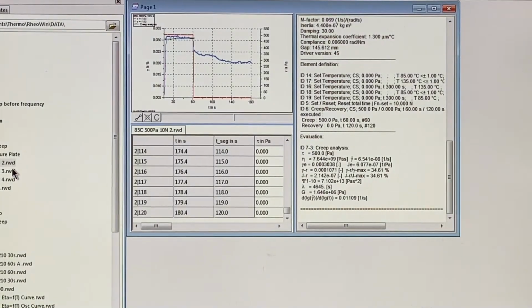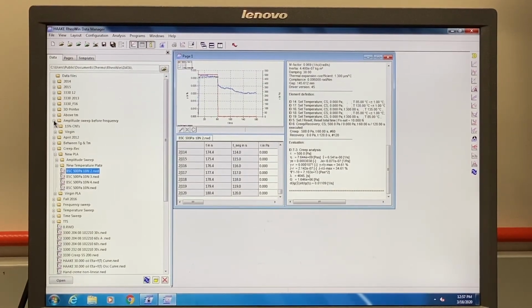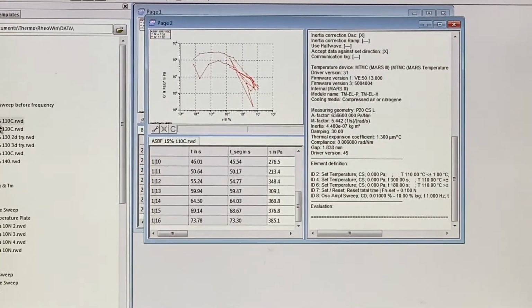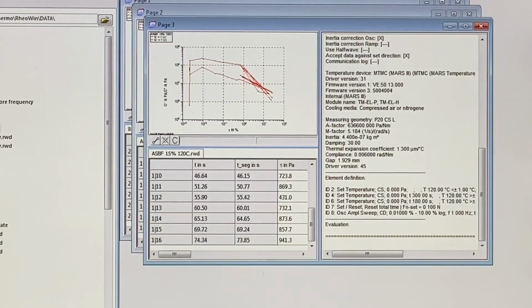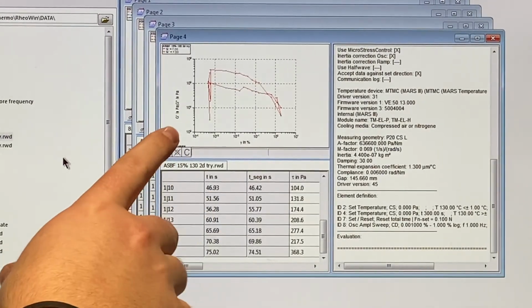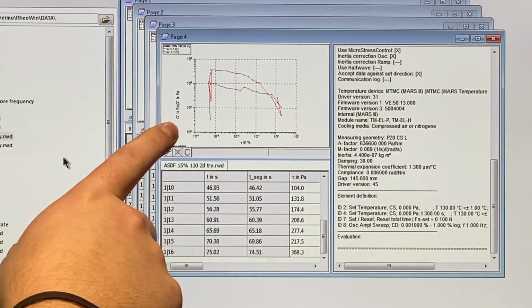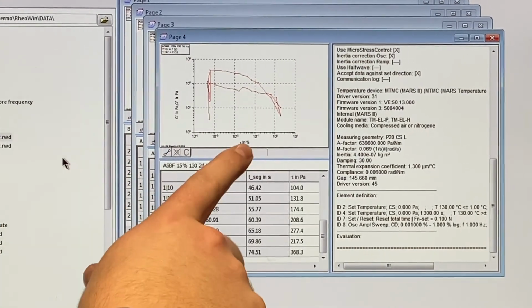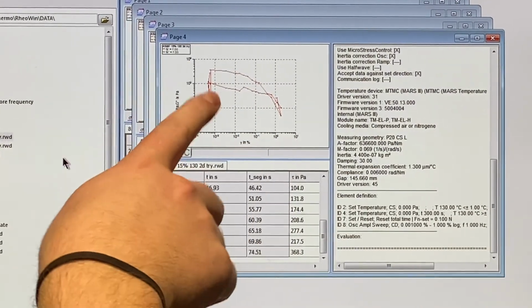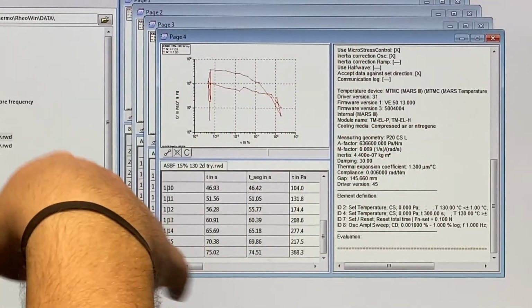This particular machine can conduct various other tests as well, including amplitude sweep. That looks wild. That also looks wild. Here, this one looks slightly more normal. So here it gives us our G prime and G double prime, the storage and loss moduli. It also gives our gamma in percentage. And right here we have the beginning of the test, and then a drop off when it's letting off and continuing to measure.